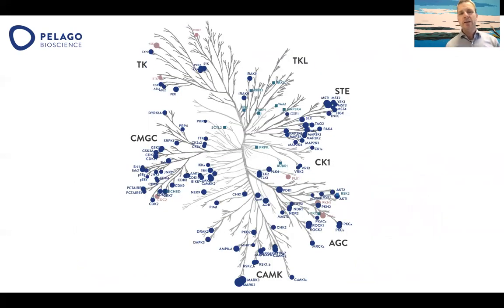Putting it up in the way that we're usually accustomed to looking at kinase selectivity trees, one of these family trees, you can see here that is then our data set in a single run. We've been able, in the same method format, to show the known selectivity targets of staurosporine, confirming what we already know, but in a single run.